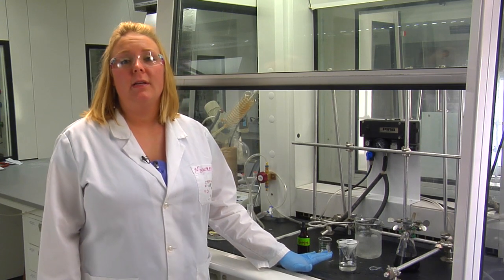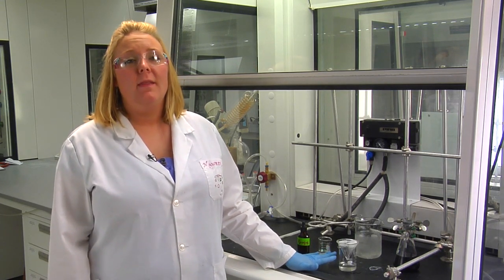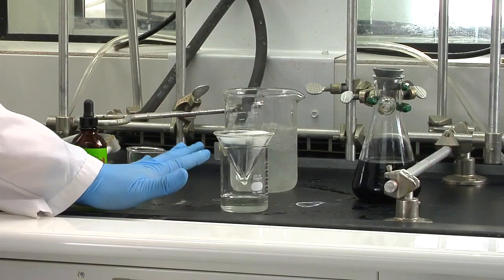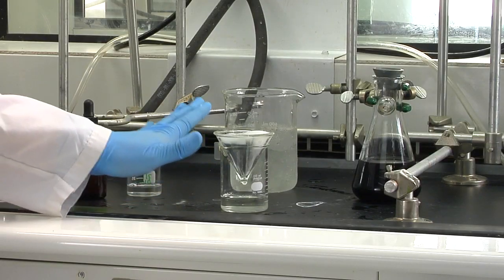We'll then put this ether real solution into a separatory funnel and extract the product, just as we did in the liquid-liquid extraction lab. Then we're going to recrystallize it, just as we did in lab 1. Then you're going to store in the cabinet for the week and move on to the next reaction in the following week.